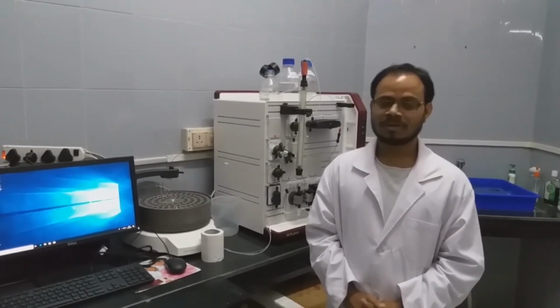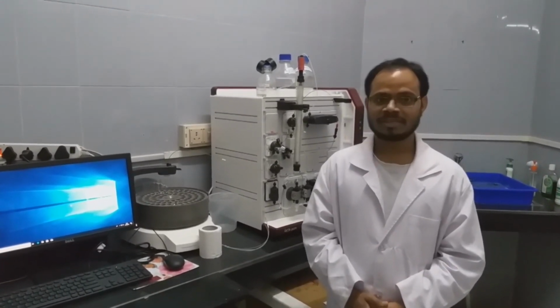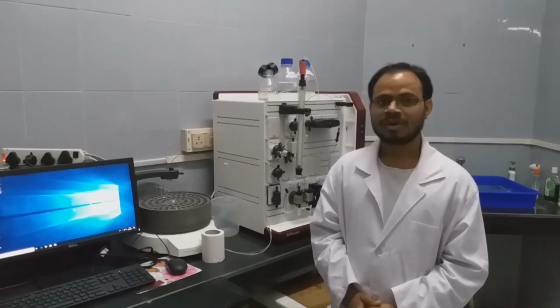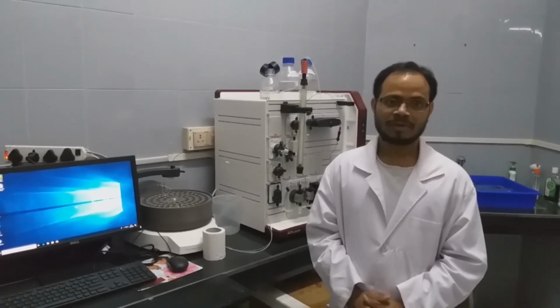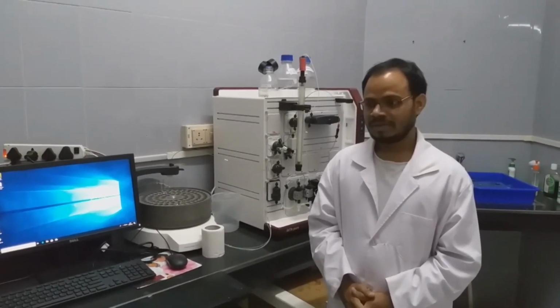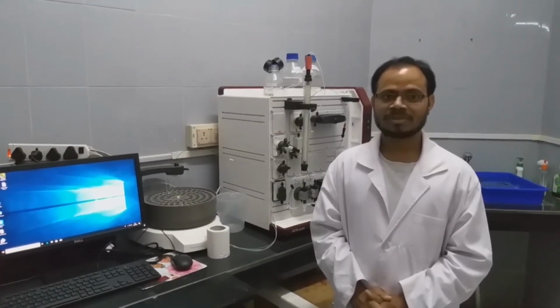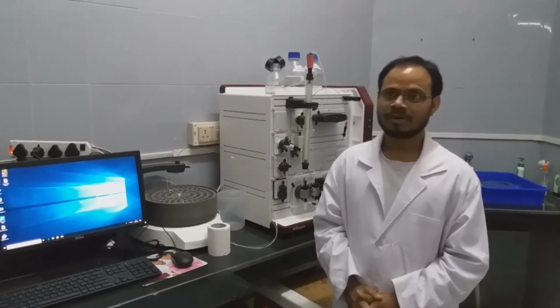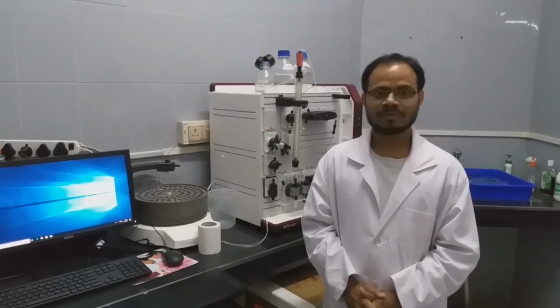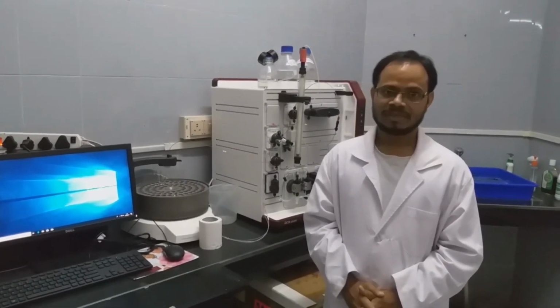Suppose you have enantiomers, those can also be separated using HPLC. The columns we use for HPLC and FPLC also differ. In the case of FPLC, we use plastic columns, but in the case of HPLC, we use steel columns.